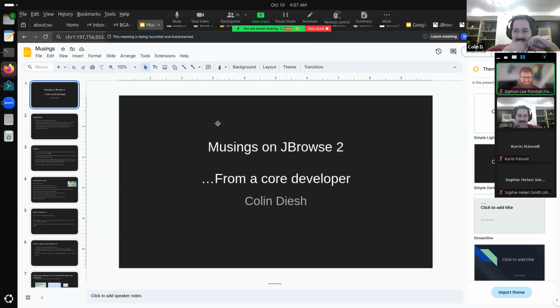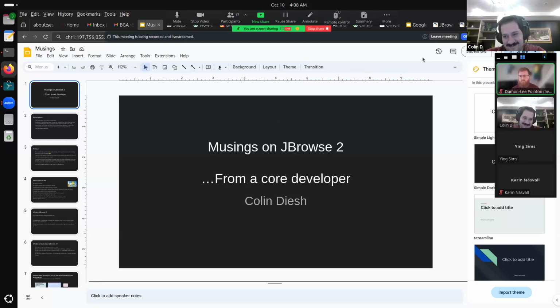I'm just going to give you some perspectives on the whole ecosystem and challenges that we face, and where I think that JBrowse2 fits into the bioinformatics universe.